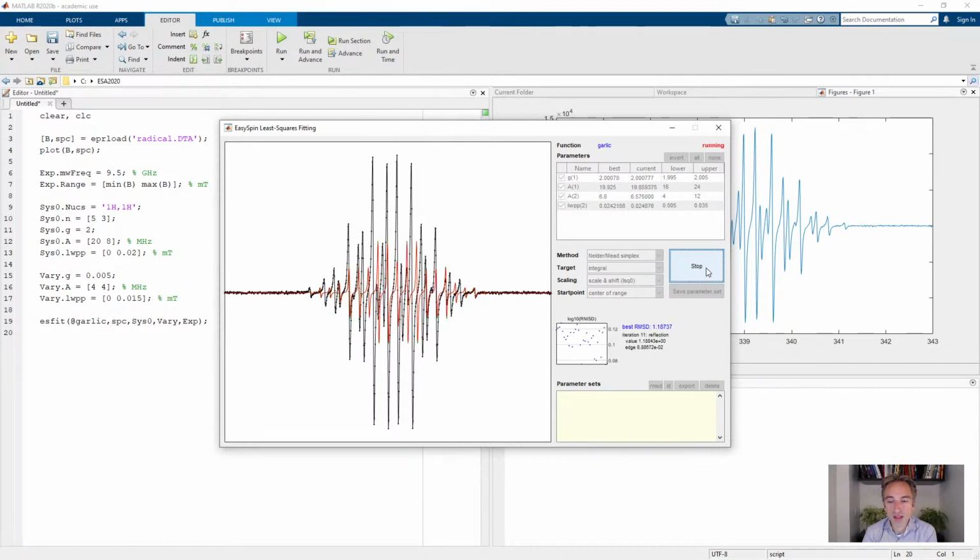And you can see with red, as usual, the current simulation, and in green, the current best fit. And it seems like it got to some sort of local minimum because it's not exploring much anymore. The RMSD is not decreasing much anymore, so it's probably just finalizing its fit in this particular local minimum. But if you look at how bad the RMSD is and how bad the fit is, you see that this is definitely not your global minimum.